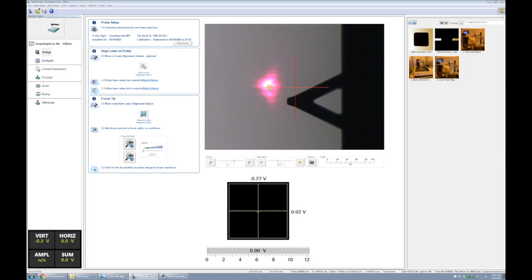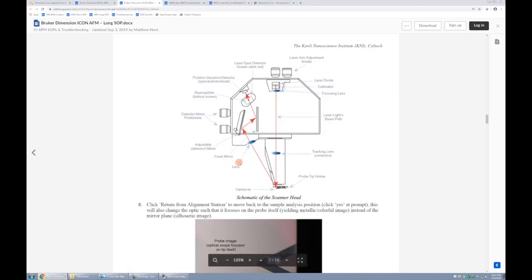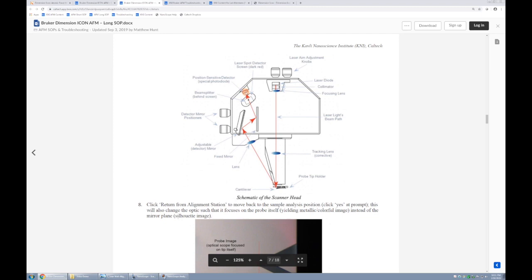Now from here, we'll steer the laser to the end of the cantilever. And to show you how that works, we can look at the long version SOP. This schematic shows that we're going to use the top two knobs on the top of the scanner to steer the laser until it bounces off the end of the cantilever. It'll come up at an angle through this lens where it bounces off these series of mirrors and hits the middle of the four quadrant detector. And in order to properly steer it to the middle of that detector, we will use these two side knobs to adjust this mirror position.